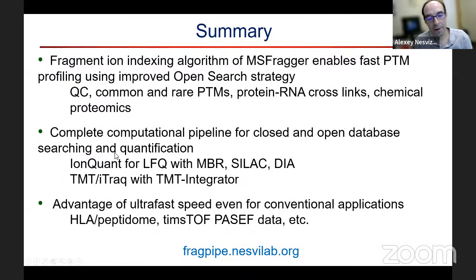So, again, thank you for listening for so long. I talked about FragPipe, from our workflows for post-translational modification analysis to the quantification that we do, whether it's label-free quantification, TMT or DIA, but we also support SILAC, and the advantages of the pipeline when it comes to speed and accuracy, and all can be downloaded from this link. FragPipe 18 is coming out soon.